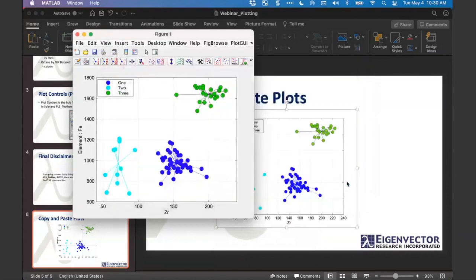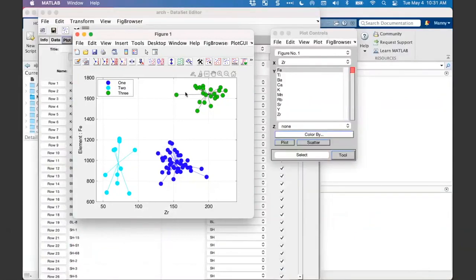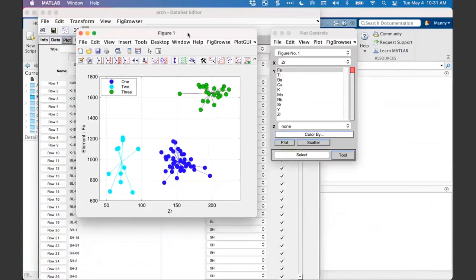EPS is my personal favorite since I work on a Mac, because then I can do any final tweaking I need to do. I use Adobe Illustrator as one example, but EPS is great because it's line art, and so it's infinite resolution. And you can also open it natively in Preview. You don't need to only have Illustrator or anything advanced. Even the Preview on Mac will open that file, which is pretty convenient.